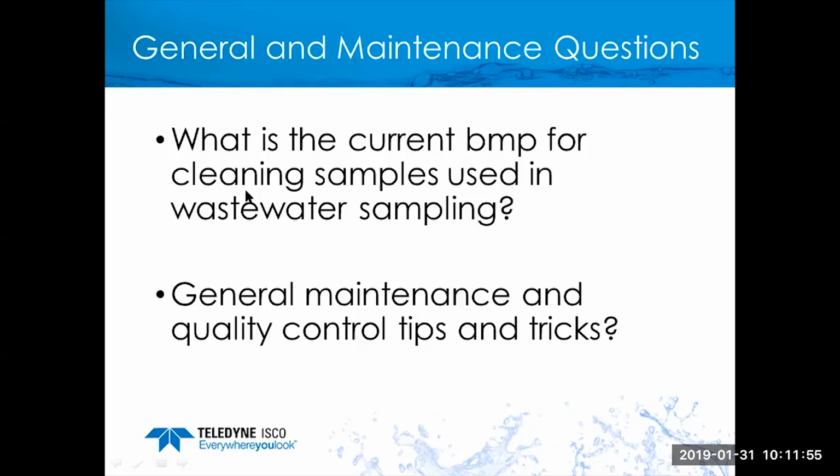Again, number one rule, the sample that's delivered to the bottle must represent the condition of the sample at the source at the time that that sample was collected. Anything that compromises or would degrade the quality of that sample by the time it gets to the lab, you risk, again, spending hundreds, if not thousands, of dollars inappropriately because of a misdiagnosis.